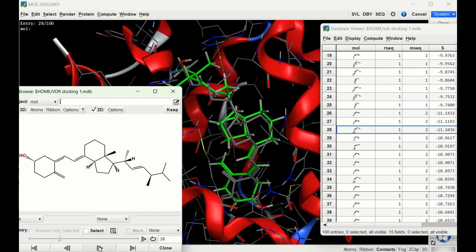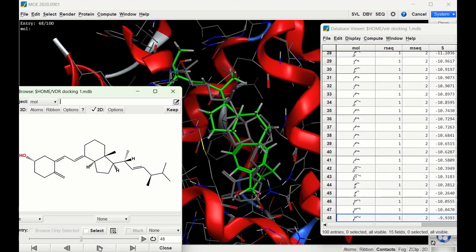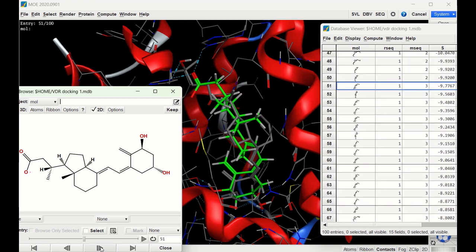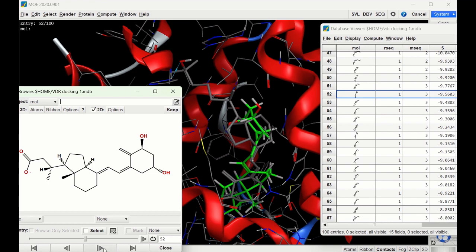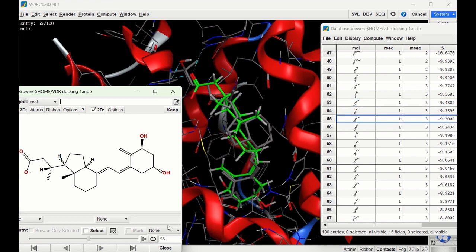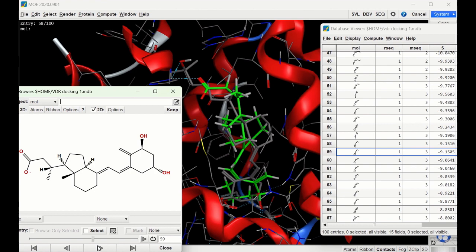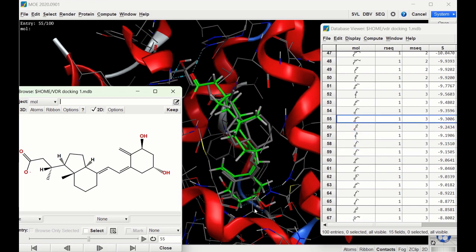Ligand three is calstroic acid, one of the final metabolites of vitamin D. The first pose is not a very good pose, and going through the others none of them are very good either — which isn't too surprising, since it's common for metabolites not to bind as well as the parent compound. The best pose appears to be one where the six-membered ring and chain line up fairly well, but the two rings are bent slightly incorrectly. As expected, the docking score is not nearly as good as for ligands one or two.